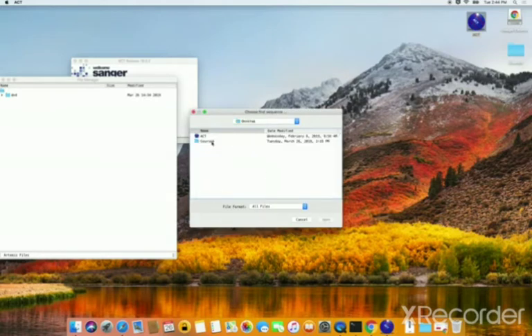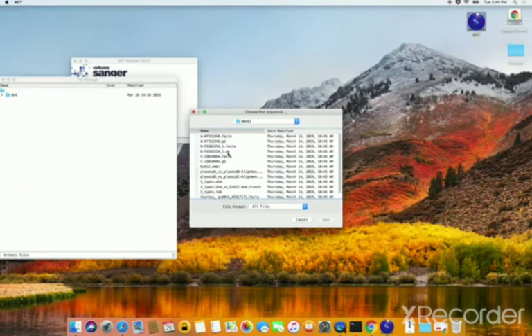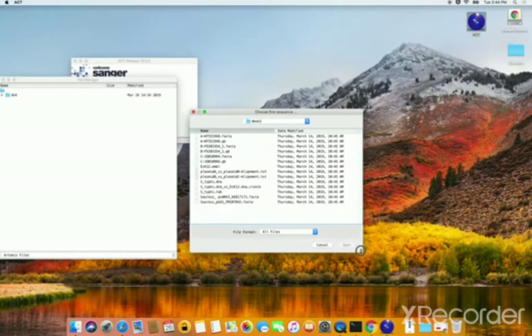So my files are on the desktop here in course 4, and the files that we are going to open are in week 2, and you have a bunch of files over there. But the ones that we're going to use are the S-Typhi DNA and the Escherichia coli K12 files. So remember that in ACT we have 3 files that we need to load. The 2 genome files or GB files that will also include the annotation, and also we need a comparison file.